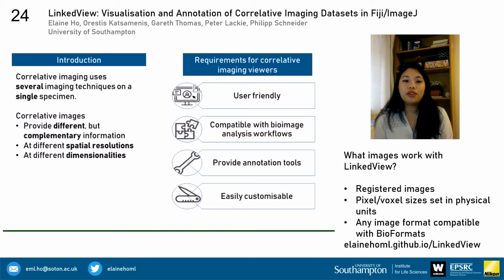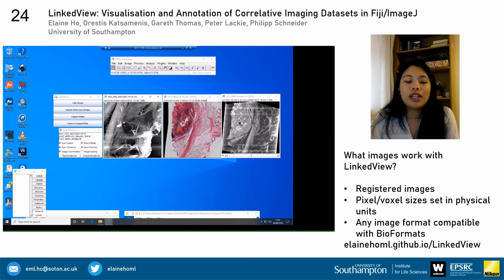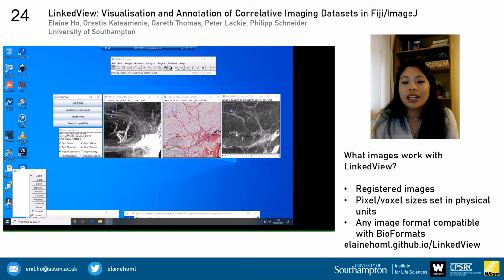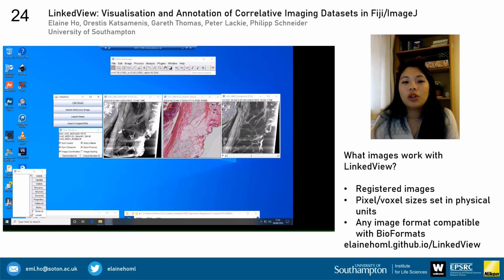So we would want a viewer which is user-friendly, compatible with our other image processing workflows, provides annotation tools, and is easily customizable for our individual needs. So we made LinkedView, which is based in Fiji. Here we are using an example data set with micro-CT and histology. You can match the displayed regions in all modalities.